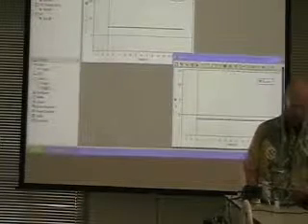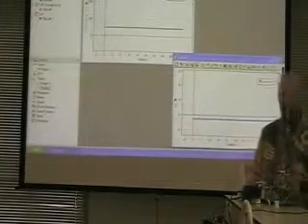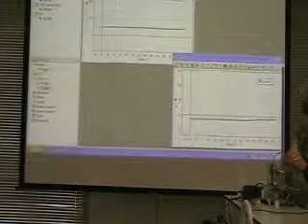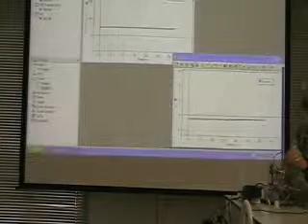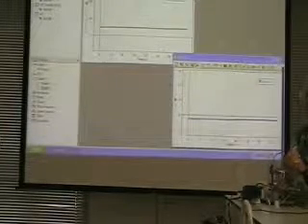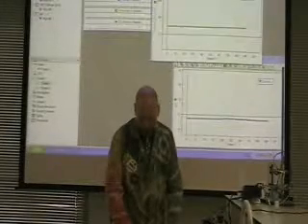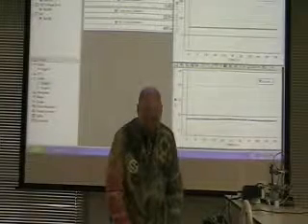All right. I'm going to take some marble chips, dump them in there, and stir. Oh, that's working a lot better than that. All right. We'll let it go for a little bit. Okay, now there have been so many bubbles produced, it's pretty much stirring itself, so I'm just going to let it do it. This is one of the problems with using pH. I'll explain how pH is measured in a moment.